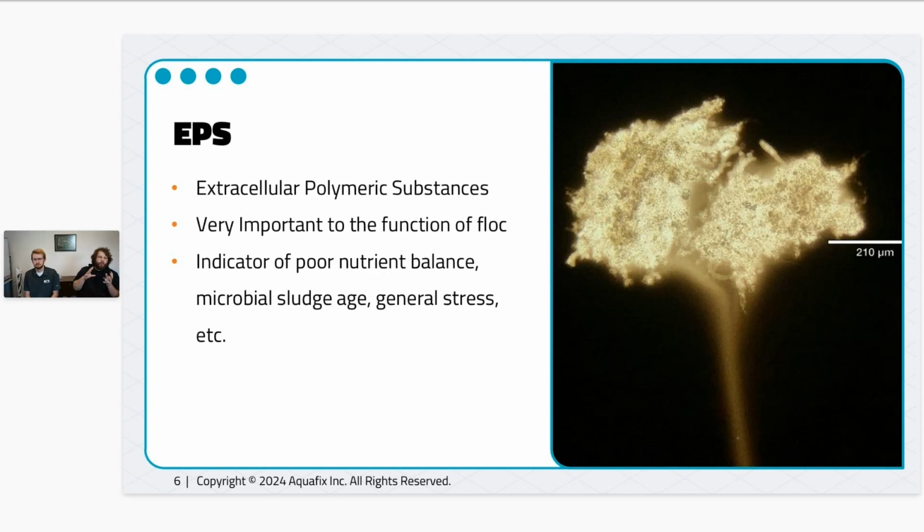in that when you get floc that get too big, you're creating little microcosms within that floc where the edge of the floc is the only area that's getting aeration. And as you penetrate deeper into the floc, it's getting less and less air. And so when you get really big floc, the insides of them tend to actually just be dead because they never really come into contact with air or nutrients or anything like that.